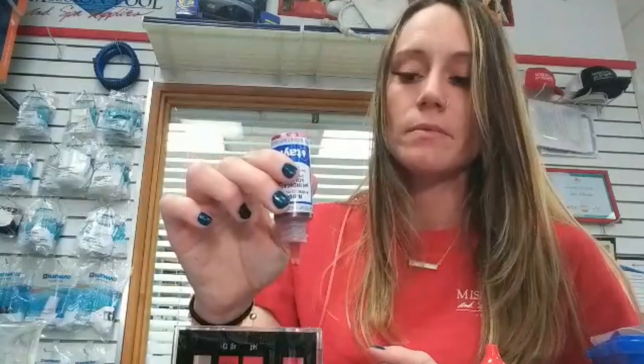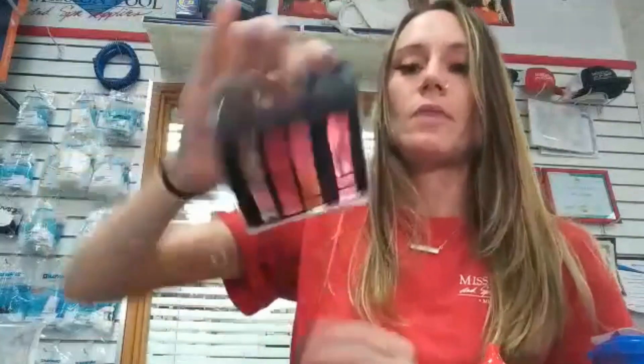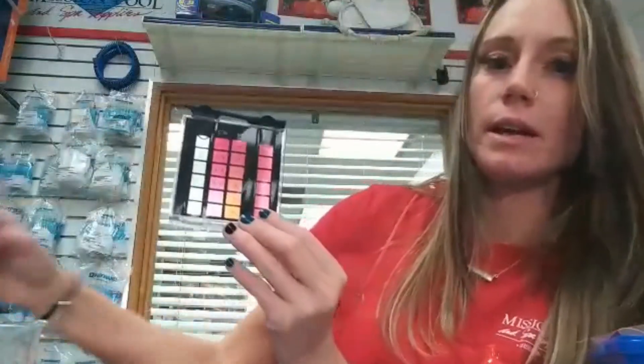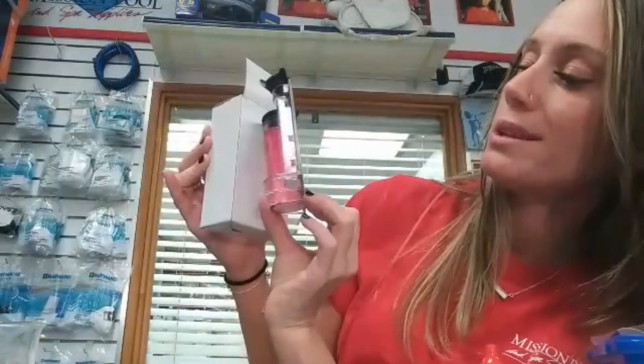We're going to do five drops. Make sure you put your lid on right away. Now you're not going to want to shake this — just tip it once, maybe twice, to evenly mix the reagent. Then you're going to want to look at it immediately in northern light or against a white piece of paper. You can see here this is probably about a seven or eight, but we're going to call it an eight to do this demonstration.